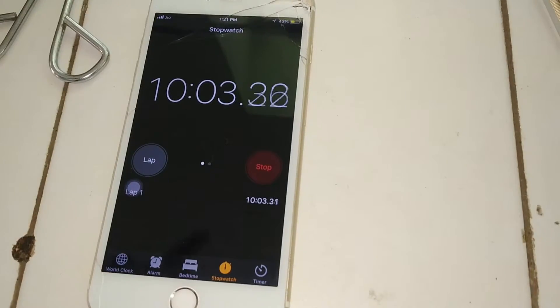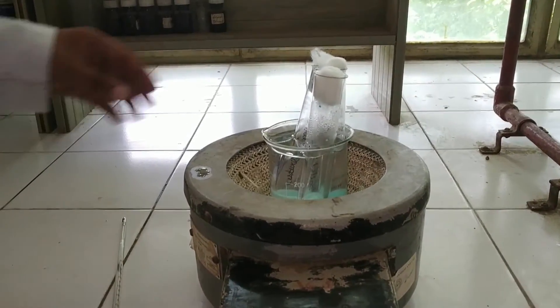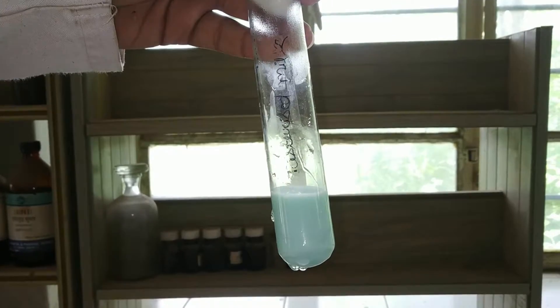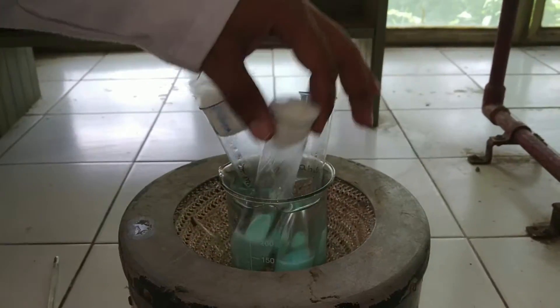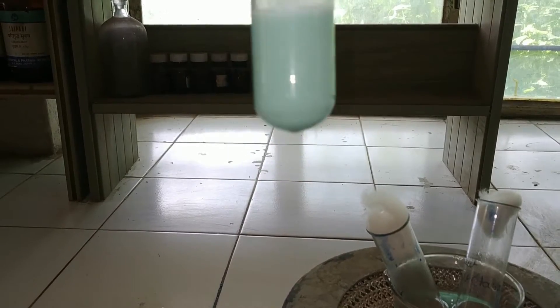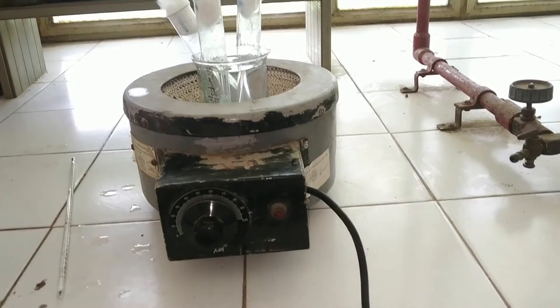It's approximately 10 minutes now. We will check the color of the samples — there should be a slight change in color. This is the pasteurized milk sample; a very slight color change has appeared in this sample. This is the raw milk sample; a slight color variation has also occurred in this sample. This is the boiled milk sample; as you can see, the color is being changed.